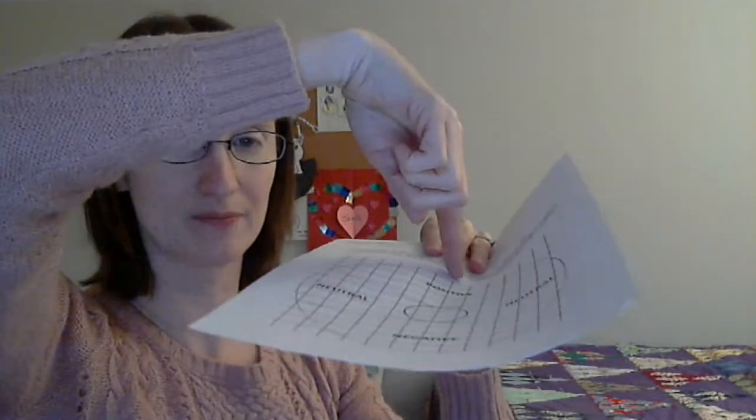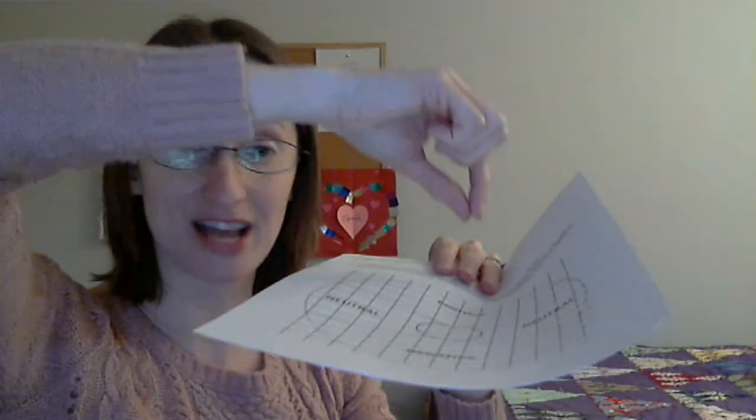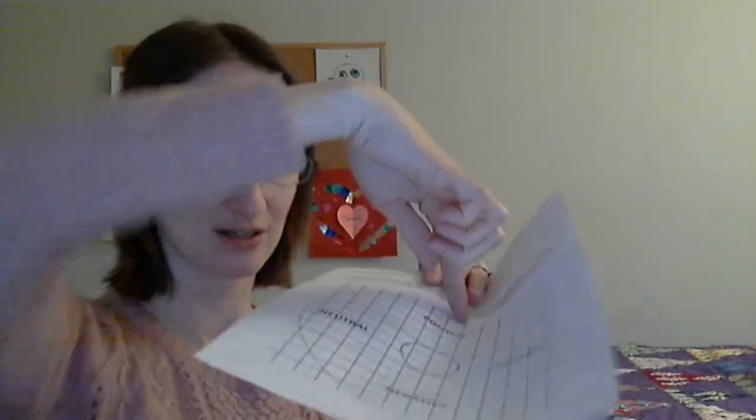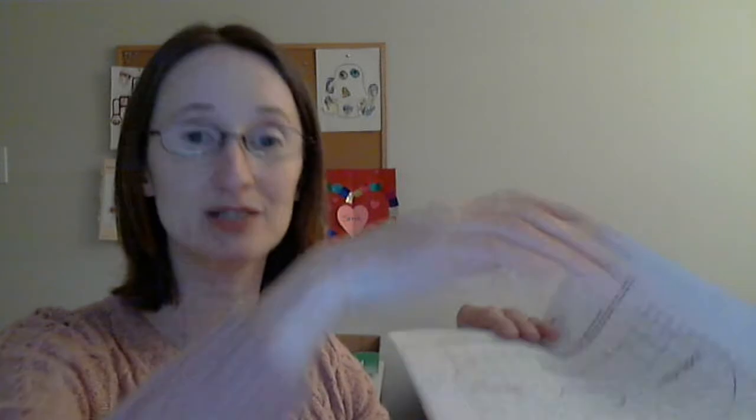Maybe you'll put a sponge that's saturated in a certain chemical at the very top. And maybe the question you're going to ask is, does the worm swim towards that sponge saturated in your chemical? Or does it swim away from it? Or could the worm care less? In that example, you're basically looking at chemotaxis. Again, are the worms moving towards it, away from it, or are they neutral towards it?